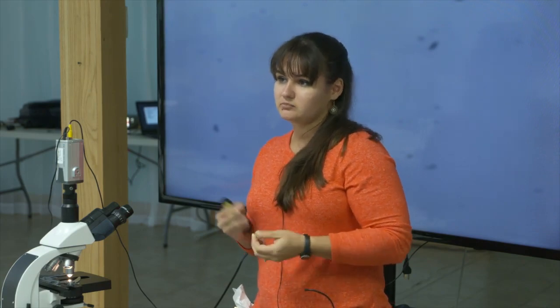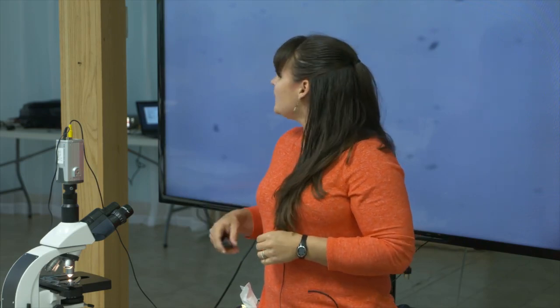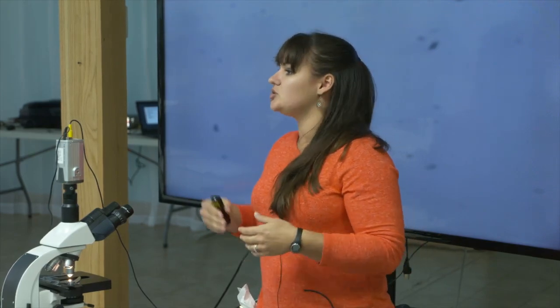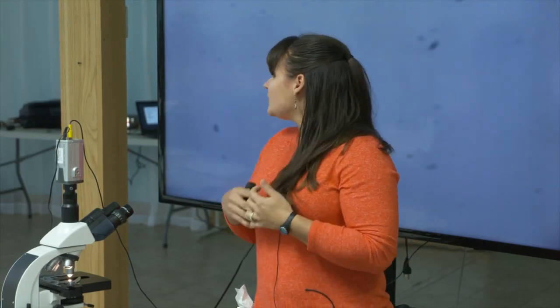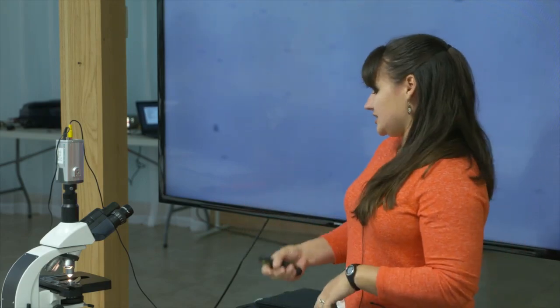A microscope is probably going to be your largest purchase. A lot of times people get them when the high school or junior college is redoing their science department. You can get refurbished microscopes online; that's going to cost you about $200 to $250. The second most needed thing is the McMaster slide, which is a type of microscope slide made directly for this procedure.